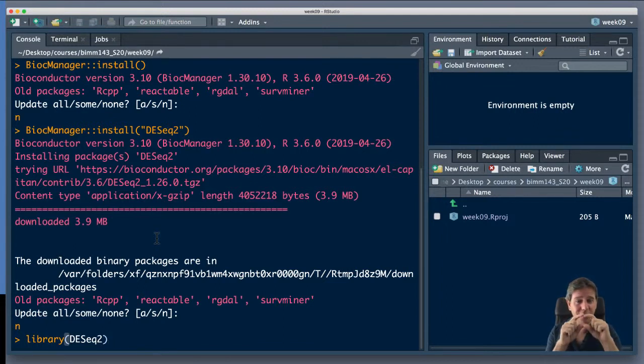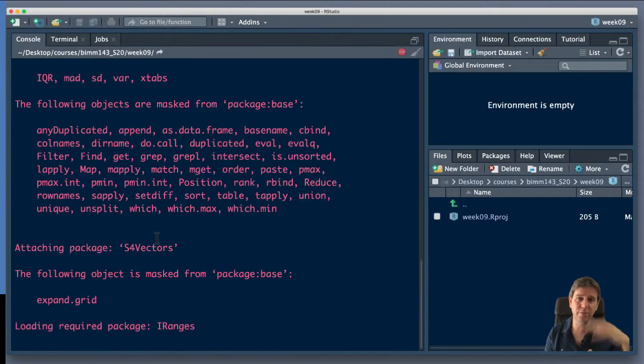If you see a big message that says error, the word error, then we've got to pay attention. If it just says warning, we'll check what those warnings are, but we should be good to go. But if it's error, then we're going to have to go back, and where we said no to those questions, the solution usually is to say yes, let's update those packages, okay? So I'm going to say load it up, and lots of red text.